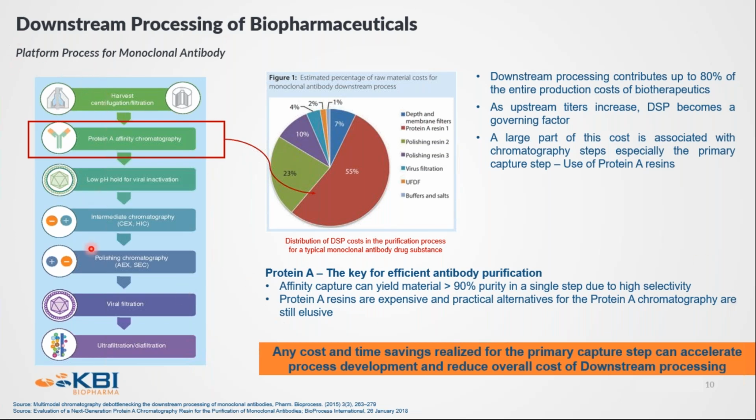On the left here, you can see the platform process for monoclonal antibody purification. We start with a clarified cell culture harvest, and we capture the target protein of interest using an affinity chromatographic medium. Most often, these are protein A resins, which can selectively capture your protein. What follows is low pH viral inactivation, then a couple of polishing chromatography steps, viral filtration, and then the final formulation.